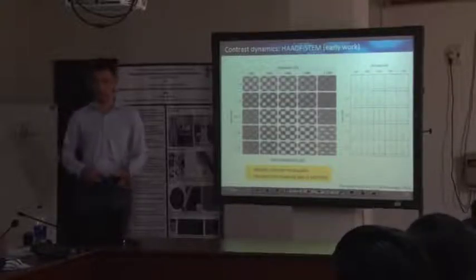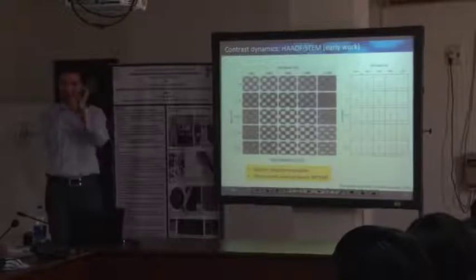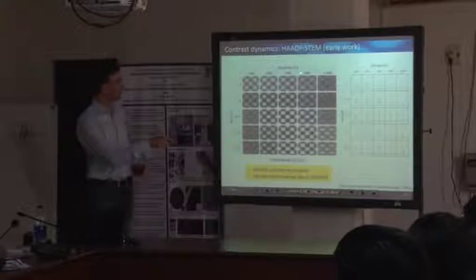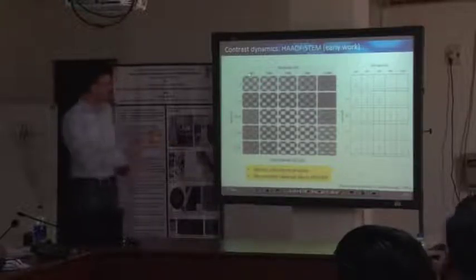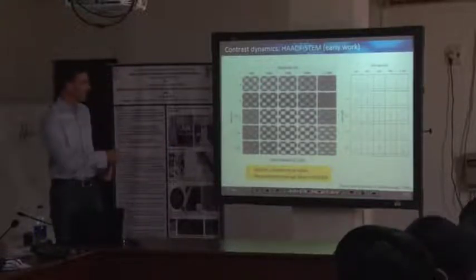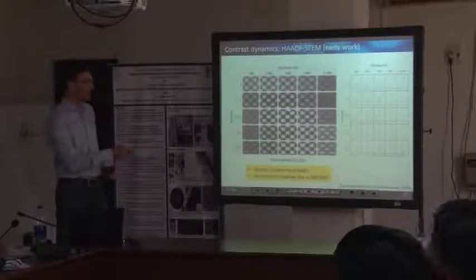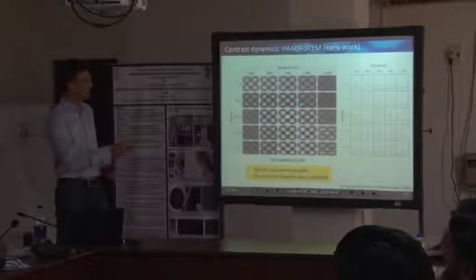Here we don't have that, so we can focus our probe a little bit higher, a little bit lower, and this is the defocus value here on a sample. This is even for an optimal convergence angle of 10 milliradian, so this is somehow the optimum. But if you go up and down, you will see that there is no contrast inversion.